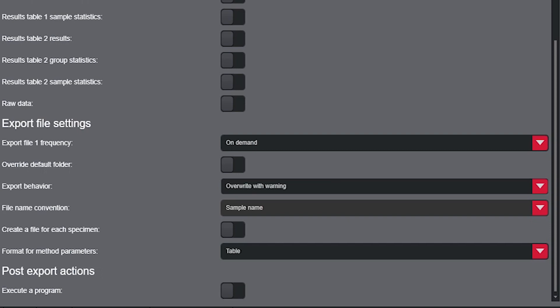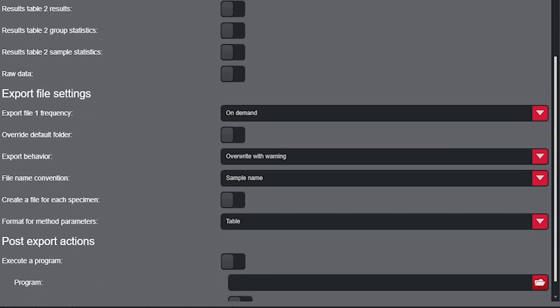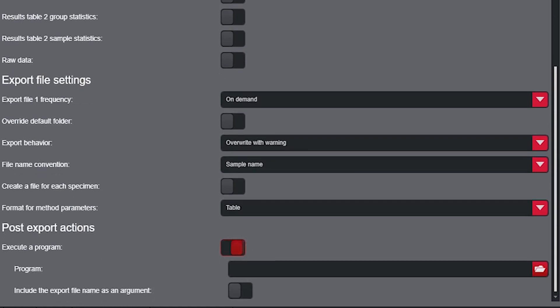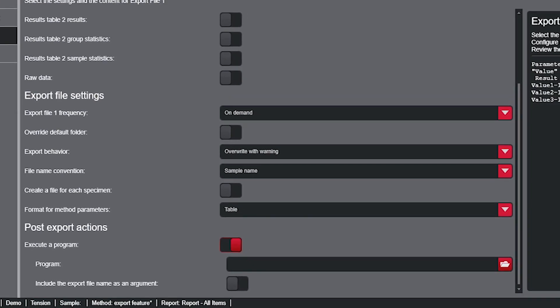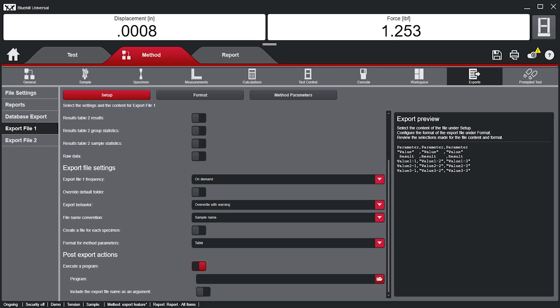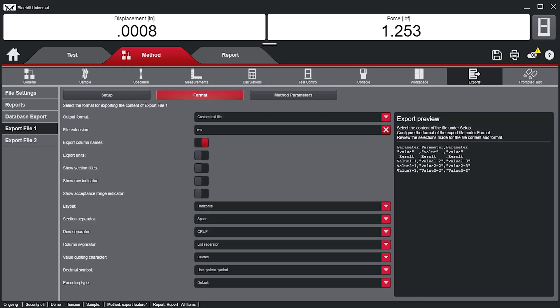In addition, users can specify the export behavior, preventing an operator from overwriting previous data. Finally, Bluehill can be configured to automatically initiate an external program. This is beneficial for users who want to pull Bluehill data into their database or LIMS system.